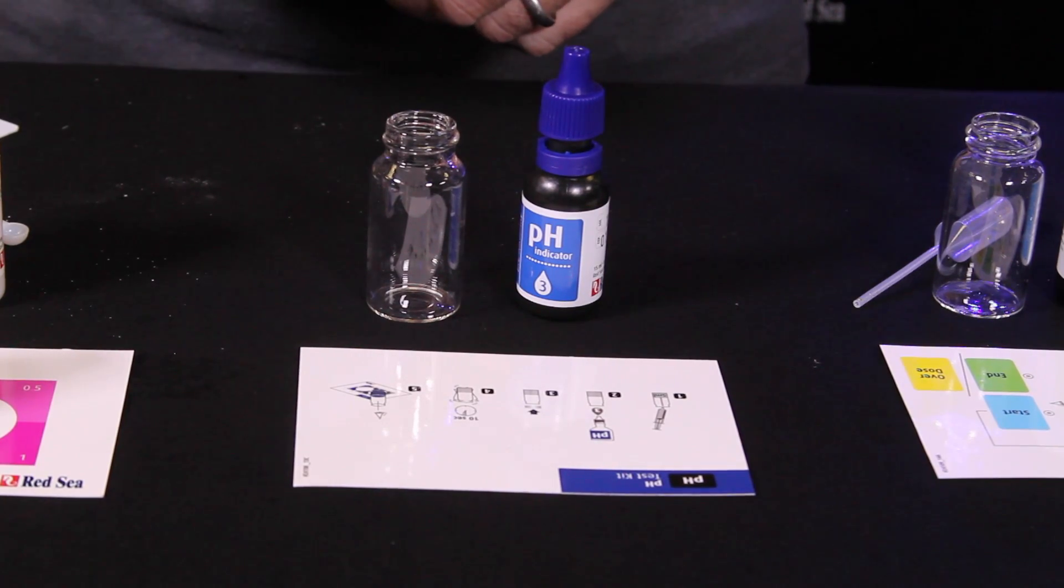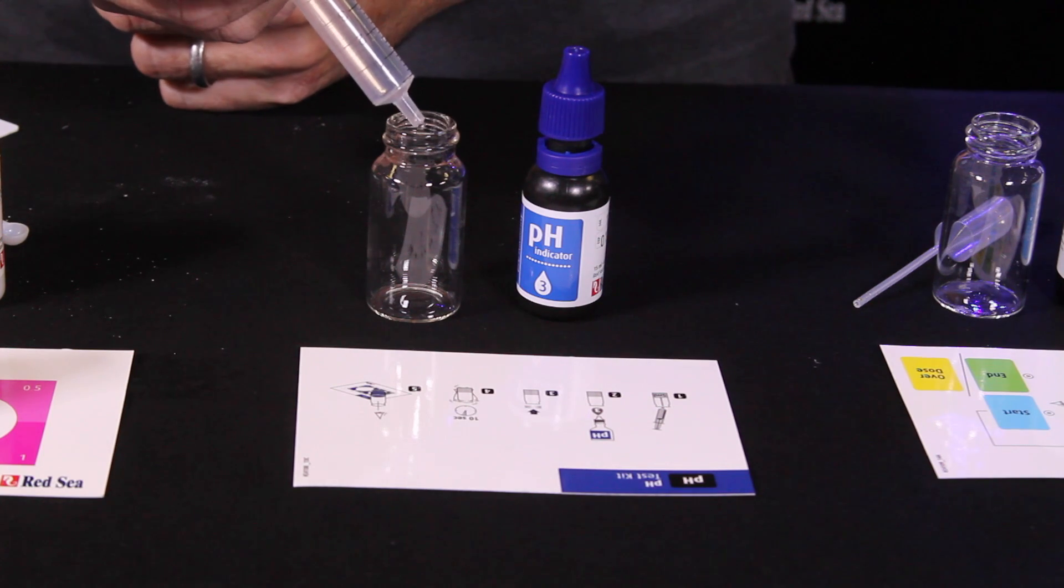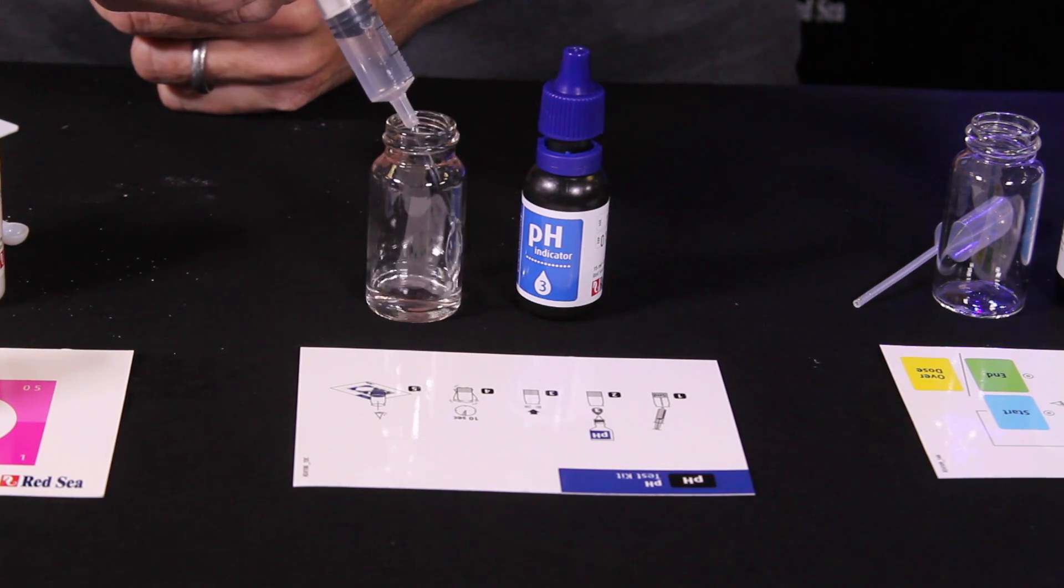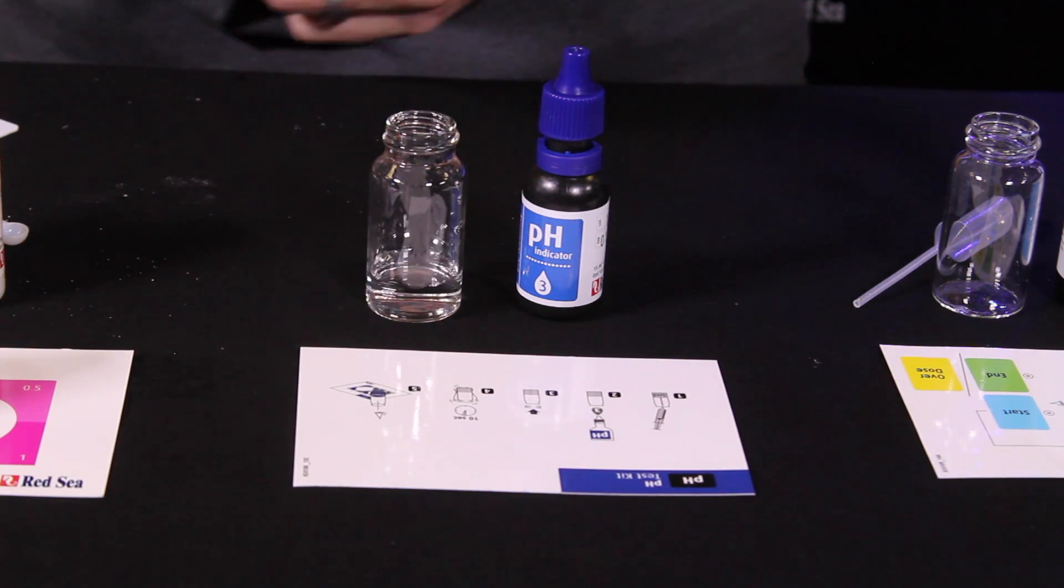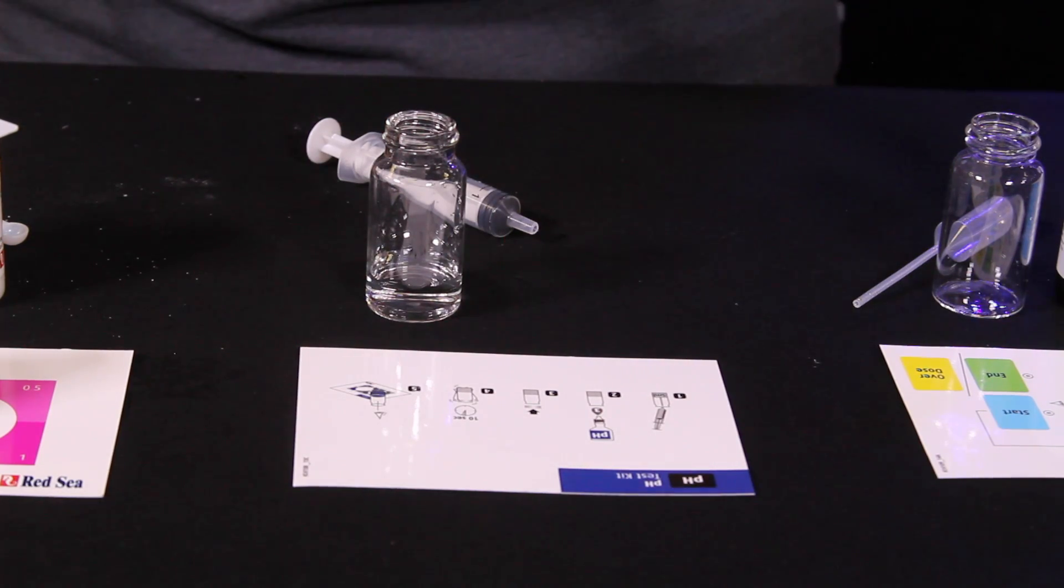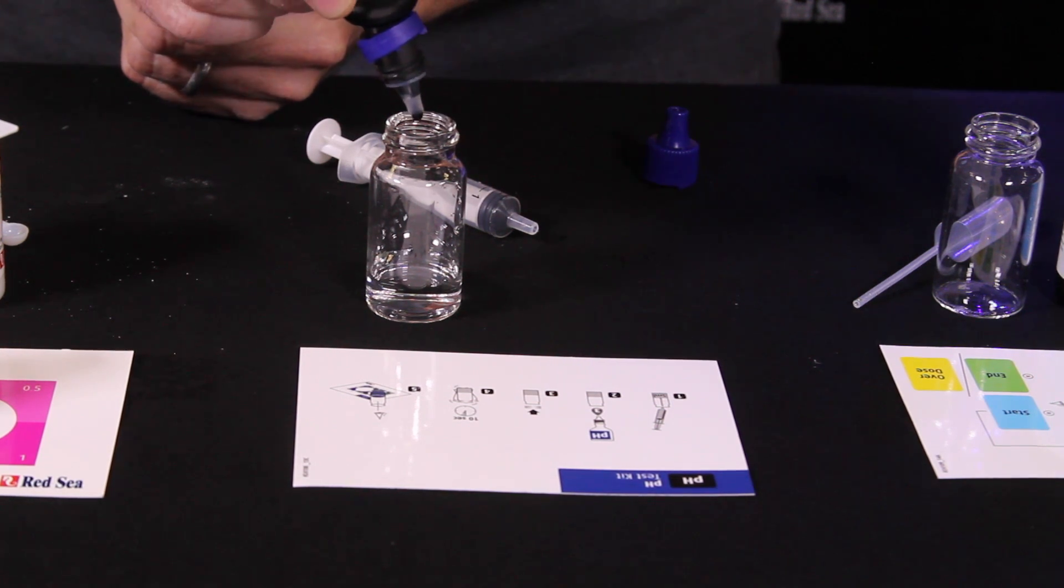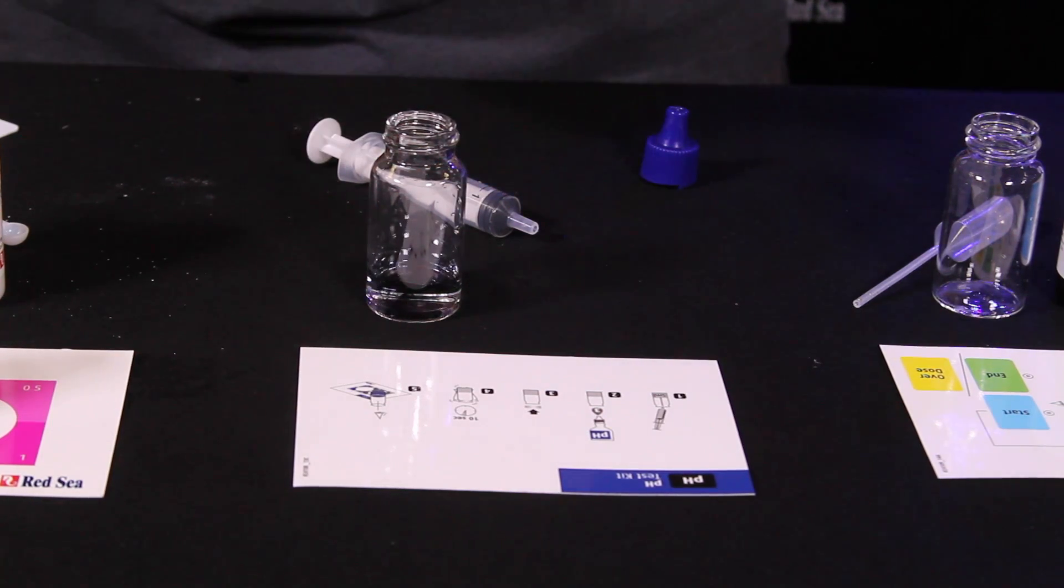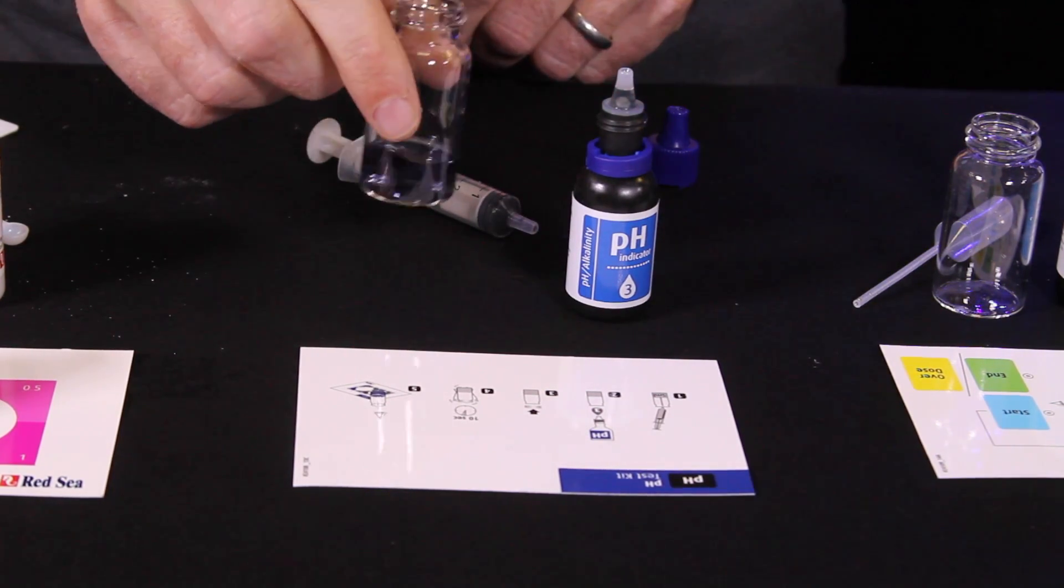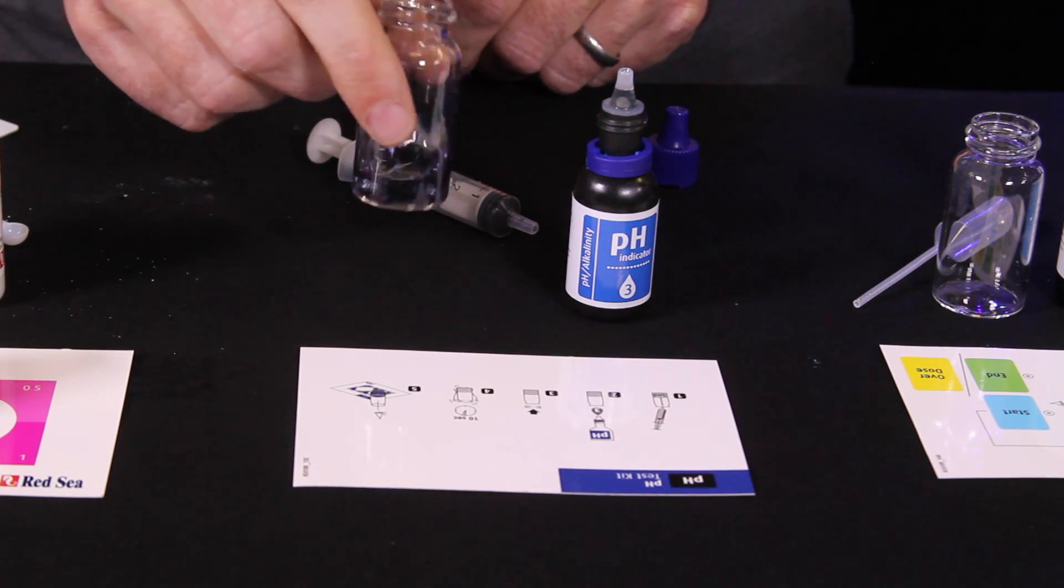All right, now let's test the pH of our aquarium. We're going to start by adding five milliliters of sample water from the tank per the instructions. And then we need to add three drops of the pH reagent. One, two, and three. The pH test is a very simple, easy one to do. Swirl for 10 seconds.